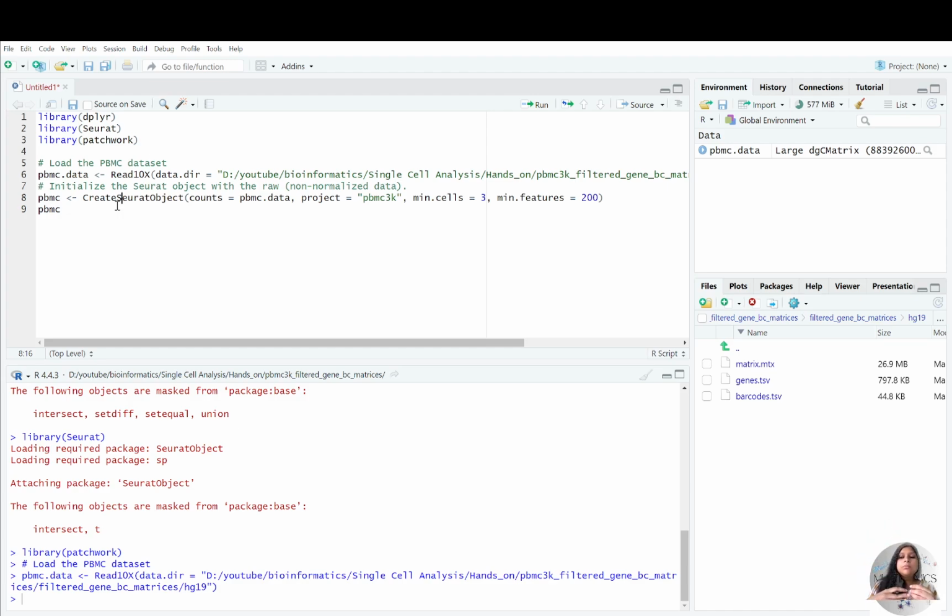So in this single cell assay, we are going to perform dimensionality reduction, quality checks, we are going to filter, annotate, and perform clustering. Then with the help of graphs, we'll be clustering, right? So all those data will be stored into various levels. Now, this is a single cell RNA experiment where you only have the data of the transcripts or the mRNA molecules.